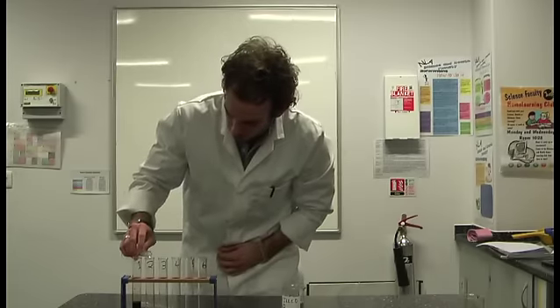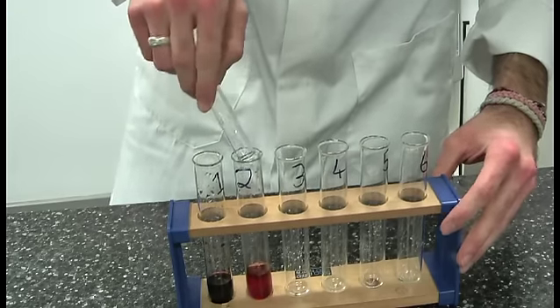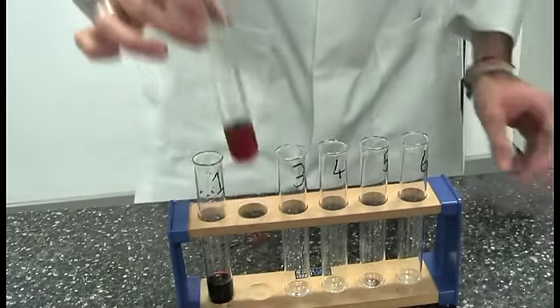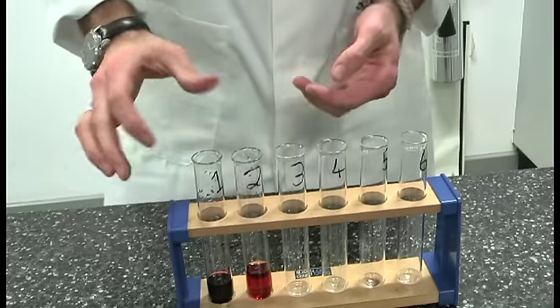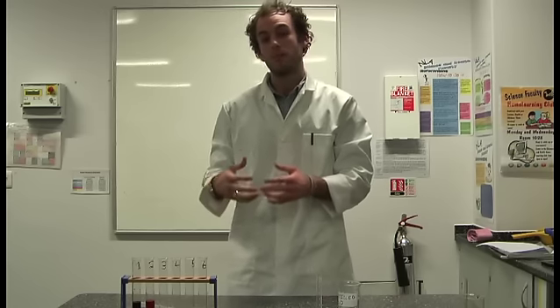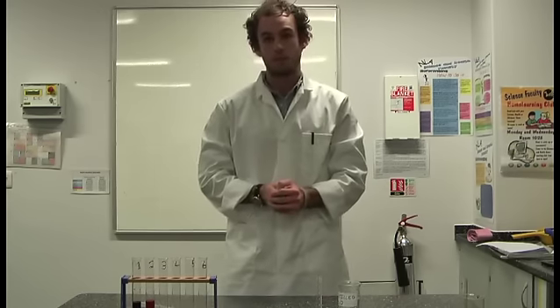Add that to test tube two like so. Give it a quick shake, and well, hey, there you are. You've just made a solution of dilution 10 to the minus one of test tube one.